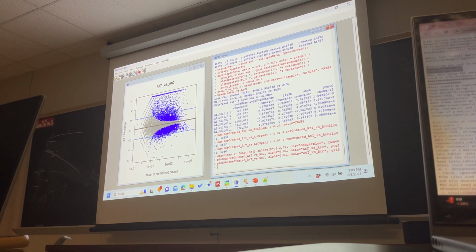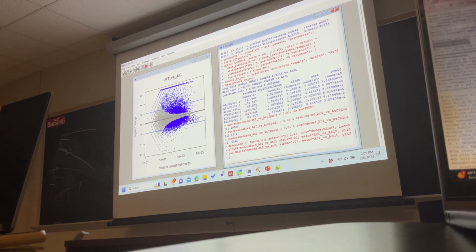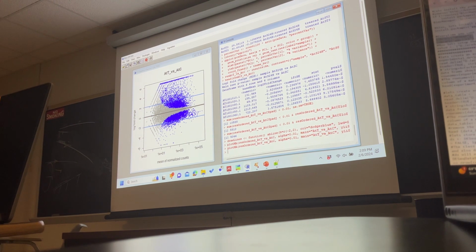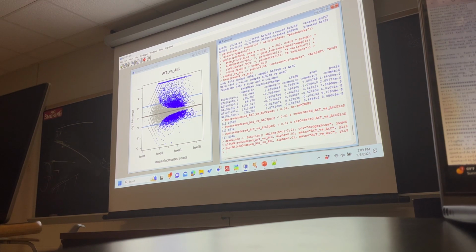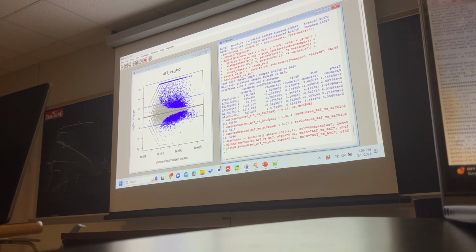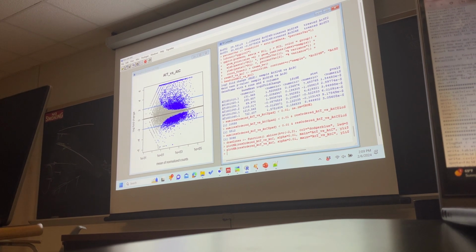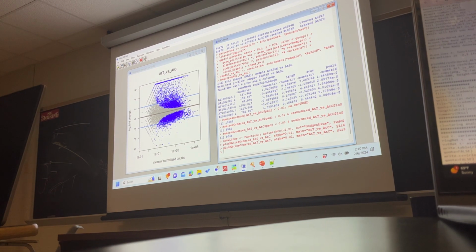You can make any cutoff here. It will show you basically the genes with a higher fold change that are differentially expressed, either upregulated or downregulated genes. And then you can change the color with a few additions to the code. You can change the dot size, or make the upregulated genes a different color and the downregulated genes a separate one. You can also write the names here of the genes that are highly upregulated or highly downregulated.